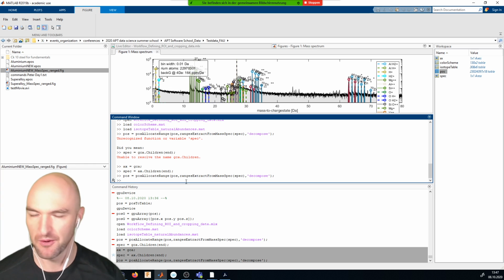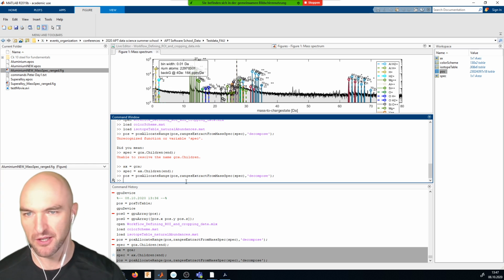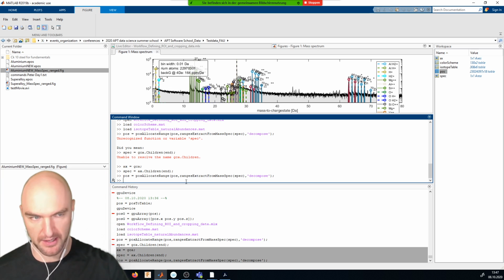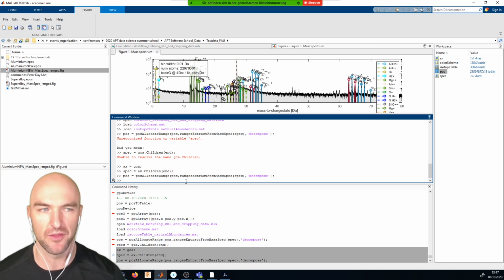Before we just used a 1D concentration profile, but we can use the very same code to do a field desorption map, for example, or a detector stack hit density map, or whatever we want. I'll start now with an example of creating a field desorption map.